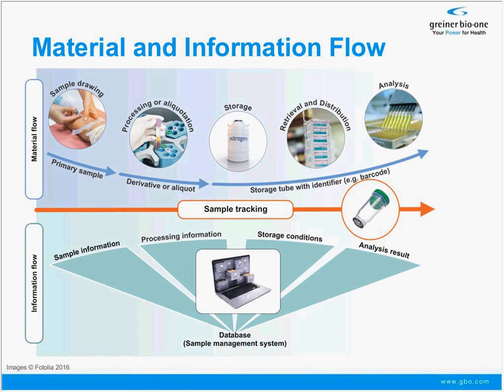What is the central element of biobanking is the storage. It can last for days, weeks, months, but sometimes even decades. And especially the long-term storage over, let's say, 10 years makes biobanking quite a bit of a challenge because, of course, during this step, samples could potentially change, which you don't want to happen to a huge extent. Afterwards, samples can be retrieved, can be distributed, and can go to an end-user's lab where they can be analyzed for certain biomarkers or bioanalytes.